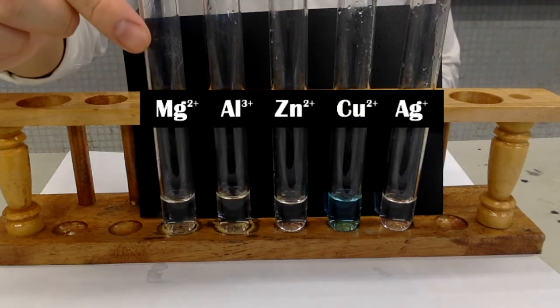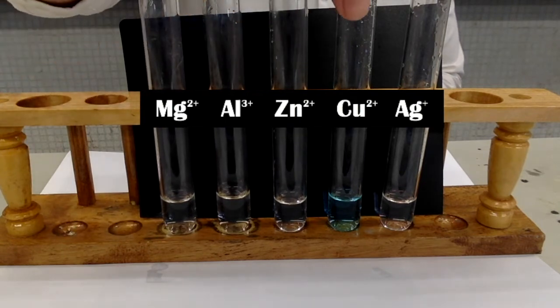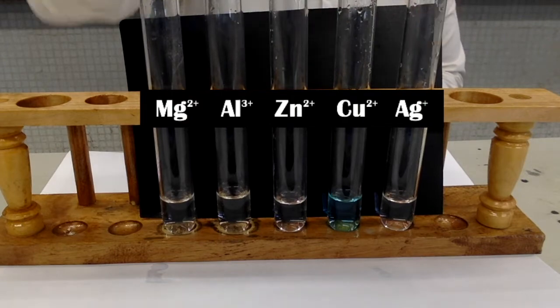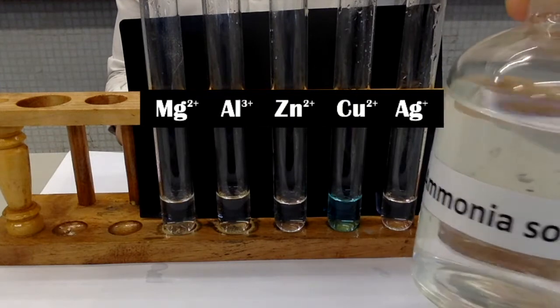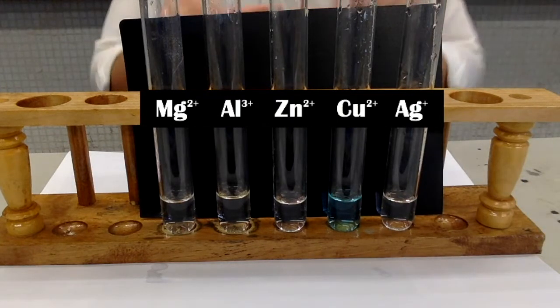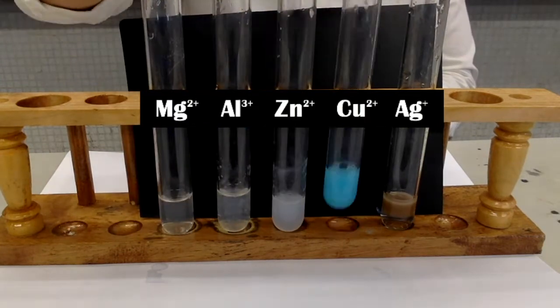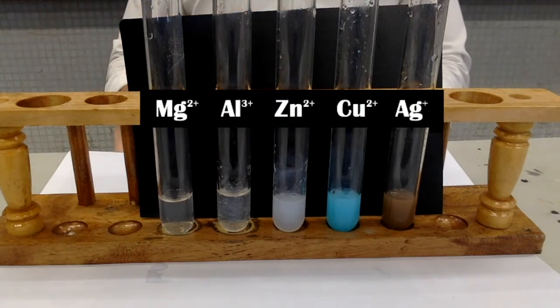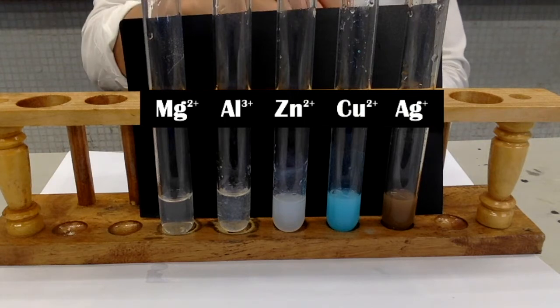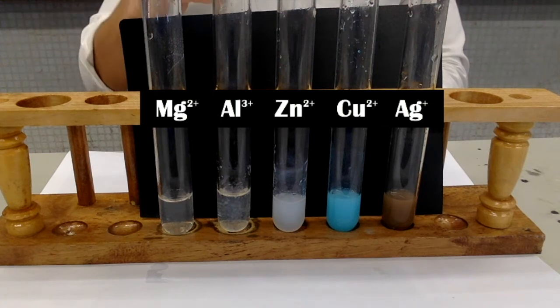Aqueous solutions of magnesium ions, aluminum ions, zinc ion, copper 2 ion, and silver ion are prepared. Add a few drops of ammonia solution into each sample. White precipitate is formed in the presence of magnesium ion, aluminum ion, and zinc ion. Blue precipitate is observed in the presence of copper 2 ion, and brown precipitate is observed in the presence of silver 1 ion.